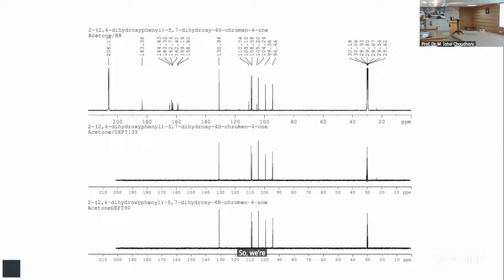For example, you have CH2 here, CH2 here, right? So these two are exactly the same if their environment is the same, here is the proton, here is the proton, so they will appear at the same chemical shift. So you can have two carbons which are magnetically equivalent, and that will appear at one chemical shift. Otherwise, and that's very rare.